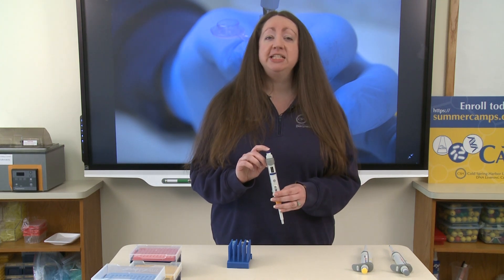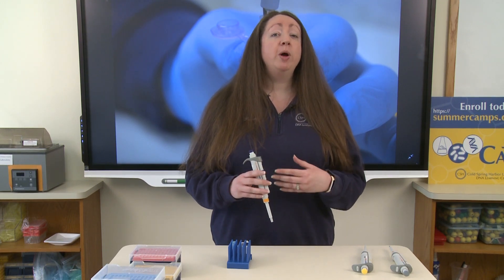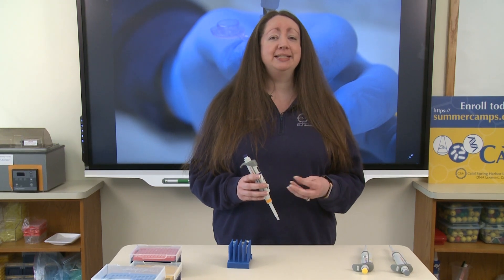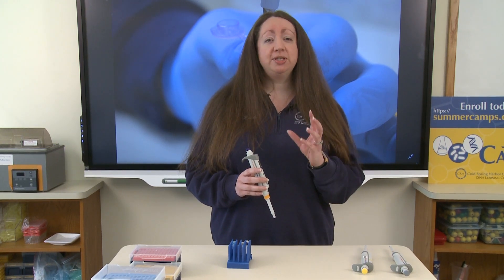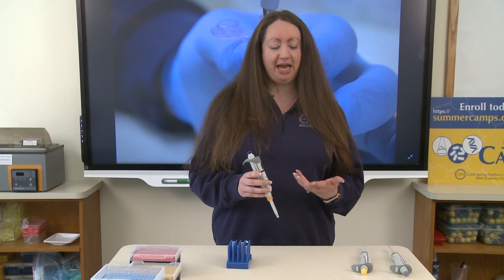1000 microliters is also one milliliter. If you're not sure about how large one milliliter is, you can think about when you go to the doctor and they give you that gross pink medicine with the little cup on the cap. Those cups usually have volumes of measurement in milliliters, so that can give you an approximate idea of how much volume that is.